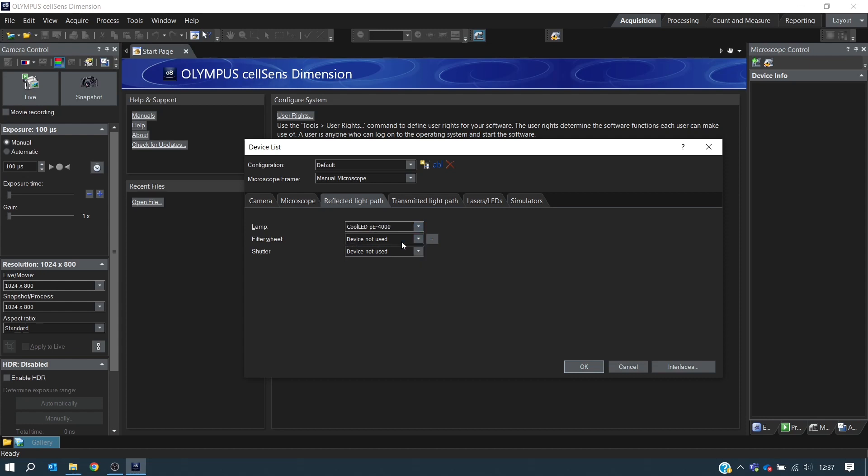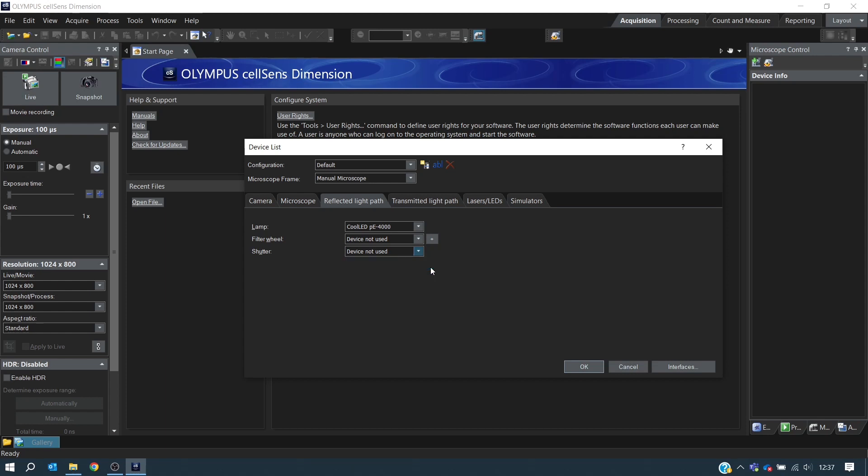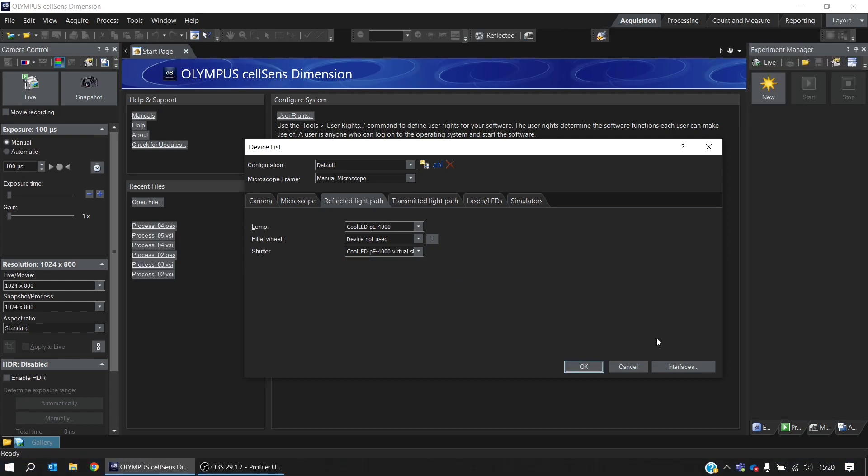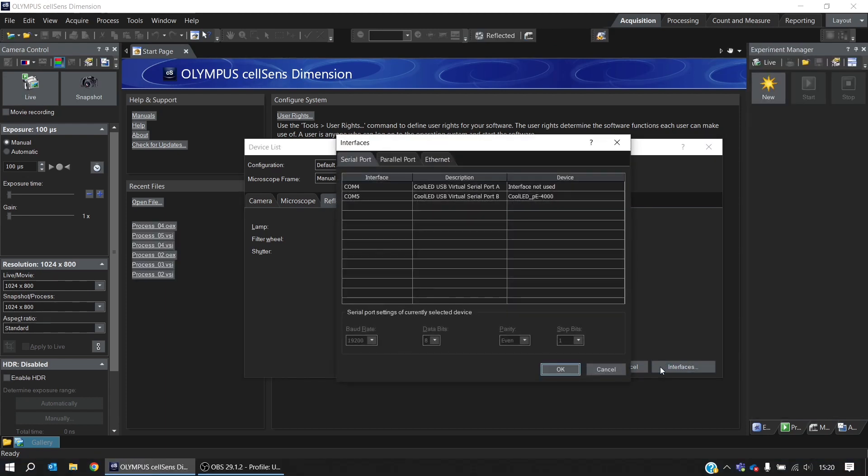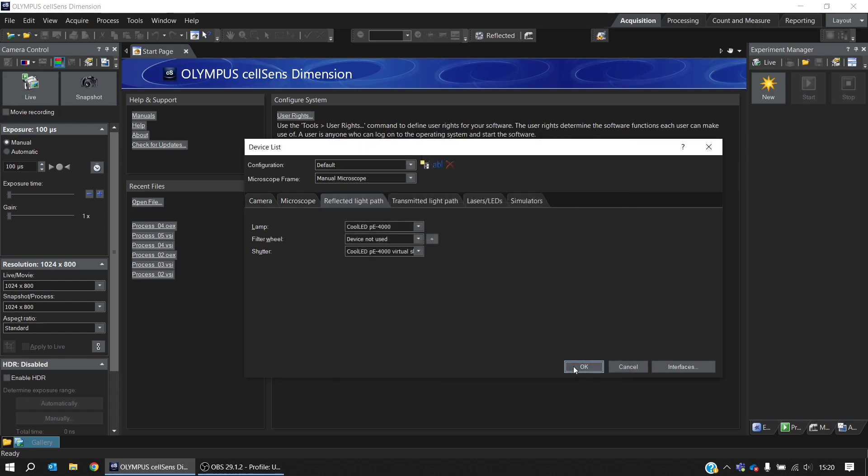We can also select the PE4000 virtual shutter. And by clicking on Interfaces, we can confirm the COM port. Here we can see that the COM port has been correctly assigned to the PE4000. But if you are having trouble with the installation, it's a good idea to look at this and cross-reference it with the Windows Device Manager. We're happy with the installation here, so we'll click OK. And we'll click OK again.